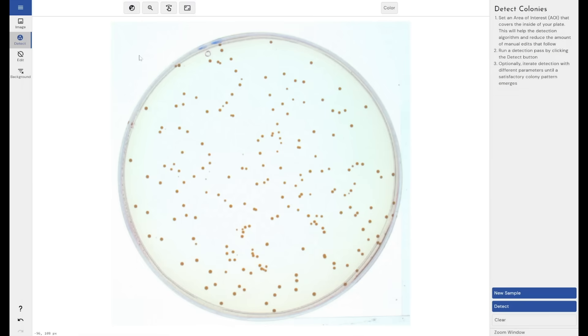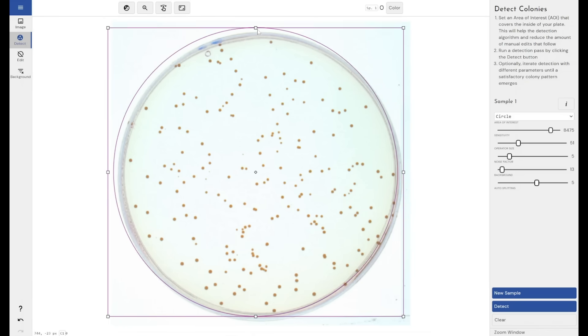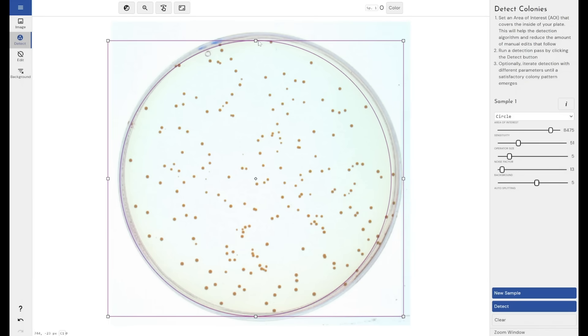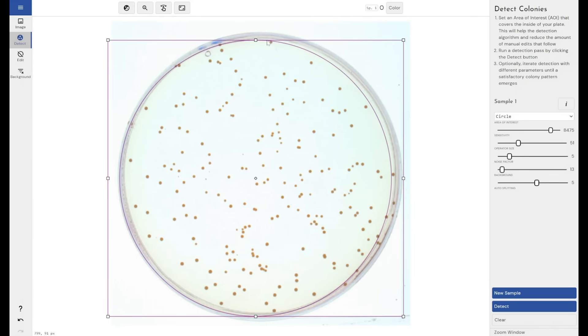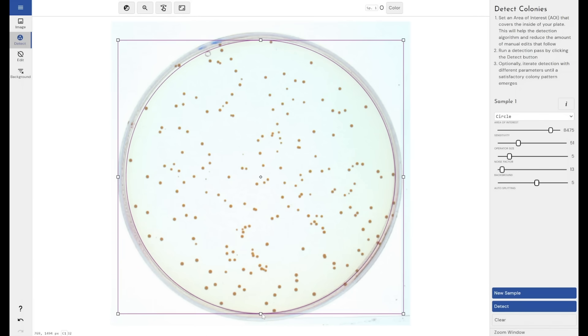If I come through now to the detect mode, by default, if I left click and drag, it will give me a circle to draw around my sample. This is the area of interest. This is the area within the plate or the wells that the software is going to look for colonies or circles.